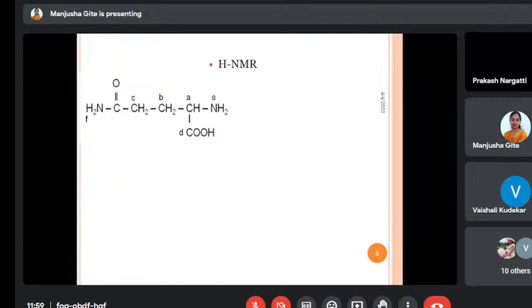Now my next question: mass spectroscopy gives a peak at 31. 31 means what? If you get a peak at 31, it means OCH3 group. Got it? Oxygen 16, plus methyl 15, 16 plus 15, 31. Yes, sir.